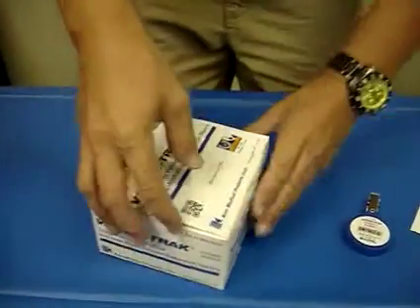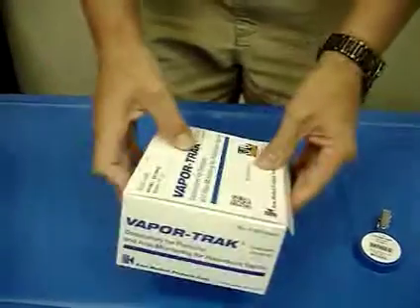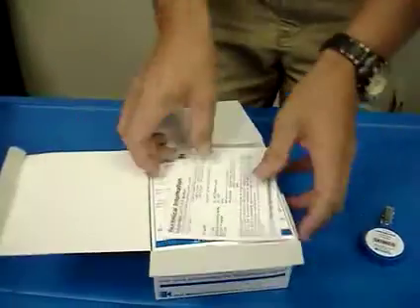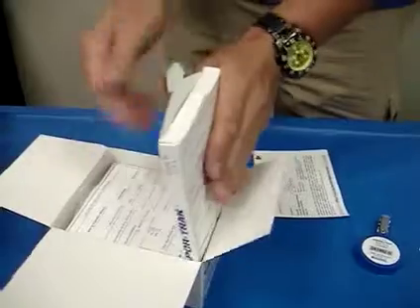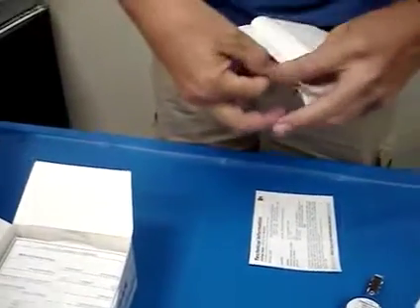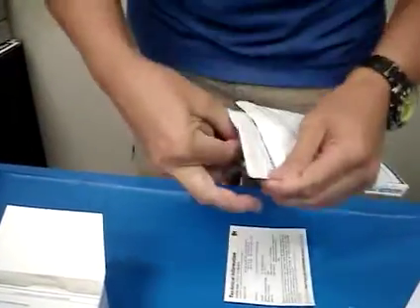Okay, we're going to talk about the monitoring badges today. Monitoring badges come in a box of 4. Inside the box, you'll find 4 mailers, 4 small white boxes. Inside each of the boxes is the monitoring badge itself. You'll find it in 2 foil pouches. The pouches are there to protect the badge during shipping.